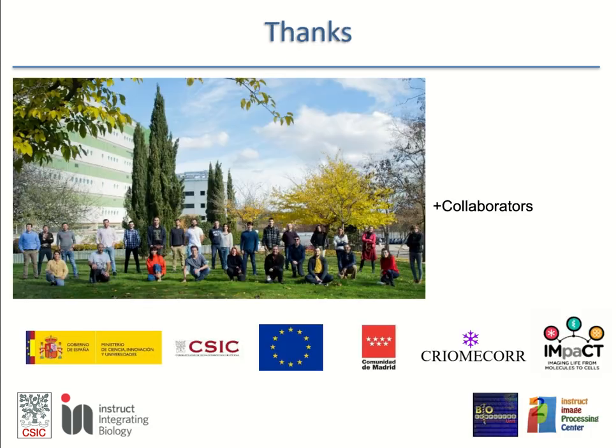And with this I'm done, and thank you all for listening to this, and I hope that you check your maps before submitting to EMDB.